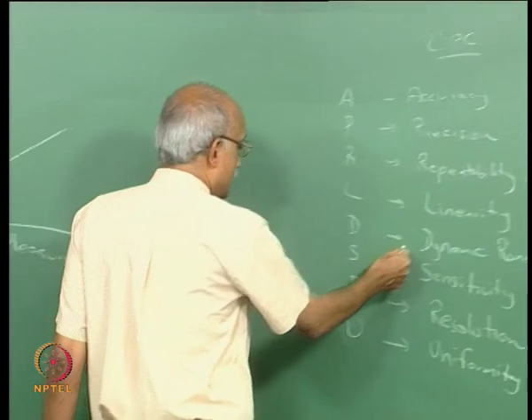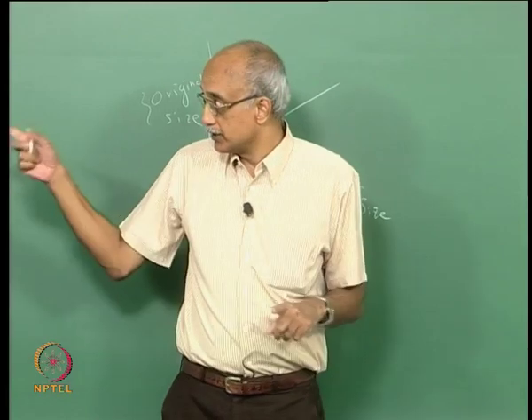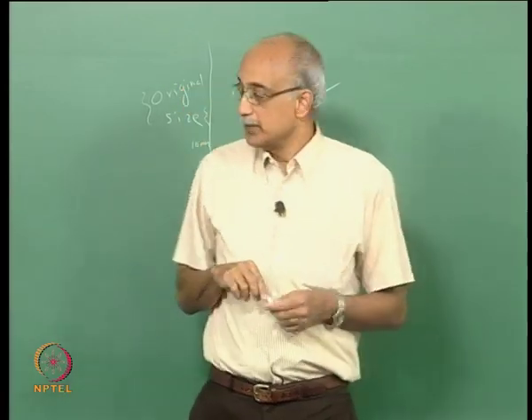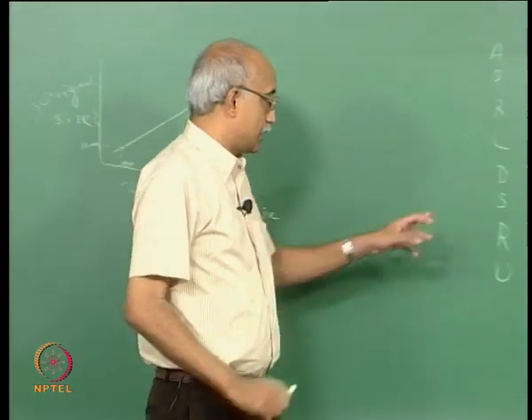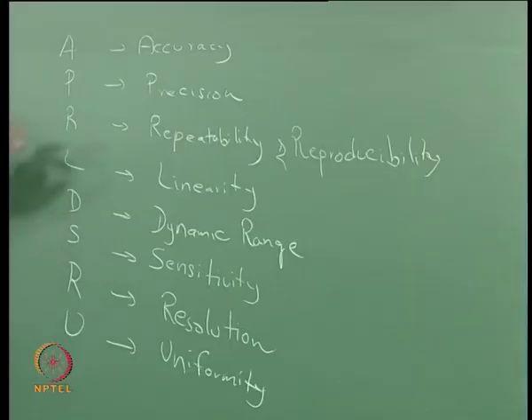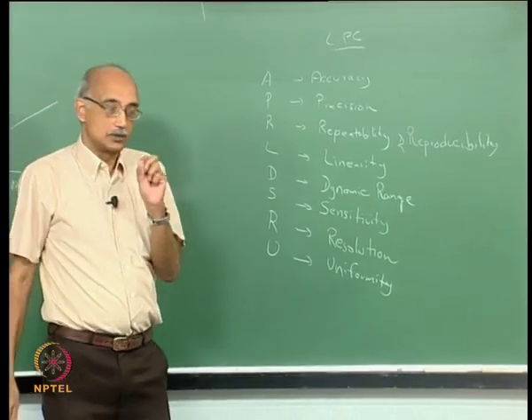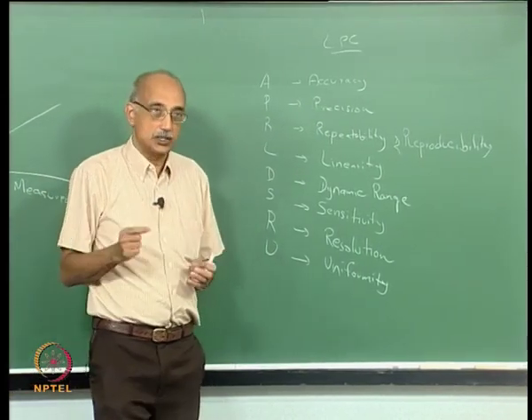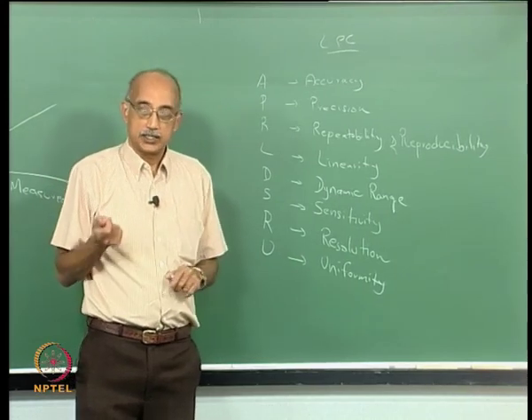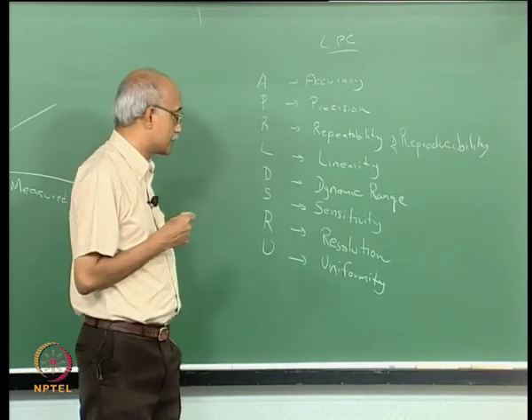Dynamic range is essentially the range in which the particle counter operates. So for the case that we have sketched over there, the range would be from 5 nanometers to 5 micrometers. Yes, the sensitivity parameter, again it's different from accuracy and precision and resolution. Sensitivity is the smallest particle that you can measure with the particle counter. So in the case of that instrument, its sensitivity would be 5 nanometers because that is the smallest size in the range in which that instrument is operated.